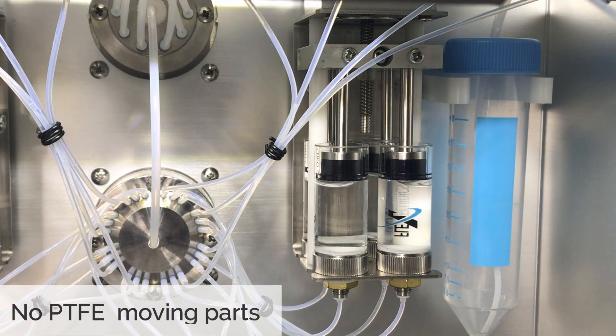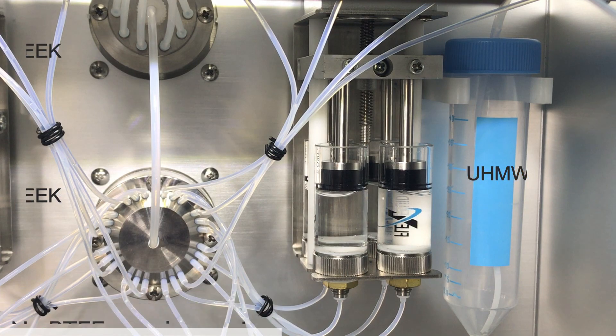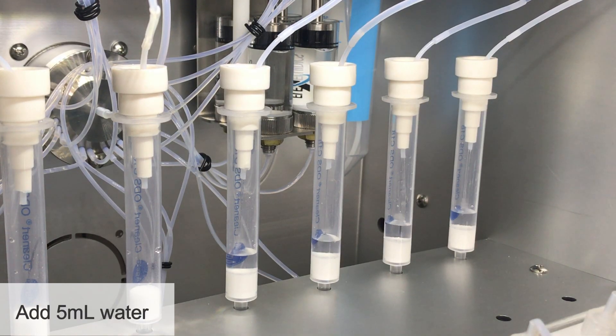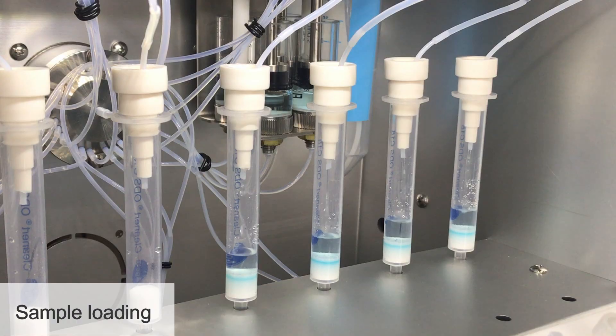The PTFE moving parts of the pump and valves have been replaced with ultra-high molecular weight polyethylene and PEEK to prevent sample contamination. After column pre-conditioning, 5 millilitres of reagent water is added to the columns. Sample loading is then performed at an adequate flow rate.